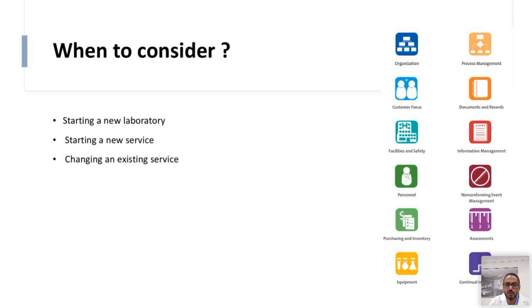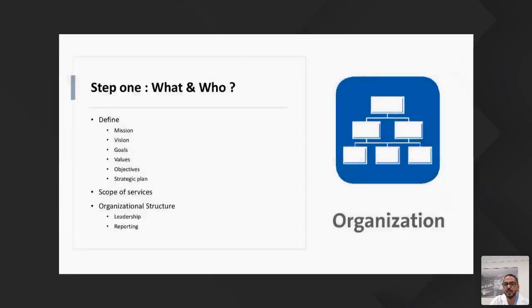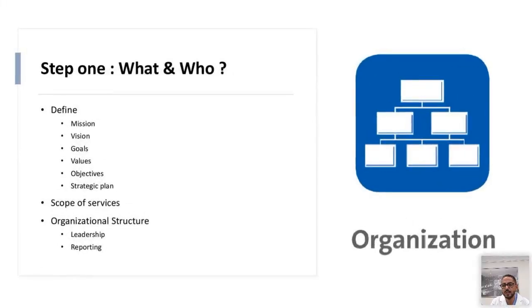You also do that when you start a new service within the laboratory, or when you try to change an existing service. So a scenario I have right now is, for example, you have a laboratory that's considering opening a new service. What would be the step-by-step guide for that laboratory to proceed accordingly within the quality management system itself?